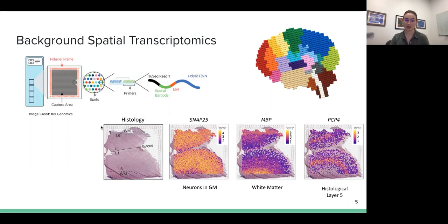And so here we have an example of a representative piece of human DLPFC. So here we have white matter and then the six cortical layers that we discussed. So here we can show the expression of SNAP25, which is a marker gene that's expressed in neurons. And we can see that that lights up the gray matter sections, whereas our white matter is dark. And then conversely, we have MBP, which is a marker for glial cells that exist in the white matter. And we can see that that lights up the white matter. And then finally, we have PCP4, which is a marker for histological layer five. And we can see that nice arc that defines that histological layer. So we're able to explore the expression of different genes in that 2D space in the tissue.